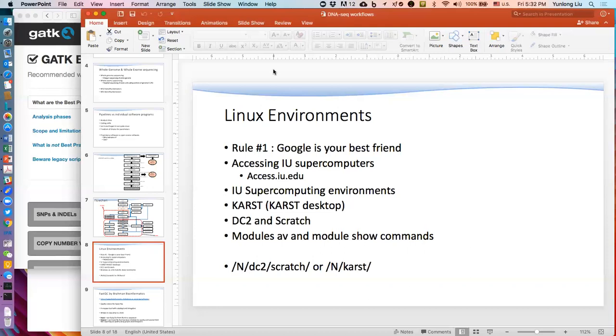I don't know if we'll get to 100%. Technology is evolving and developing, and our understanding of everything is growing, but that's a good run at 92%. I mean, 88, 92, that's not unheard of for mapping qualities. So there's always a little bit within the human genome, or actually any genome, unless it's de novo, then we're learning as we go, but there's always going to be a bit of unmappability.